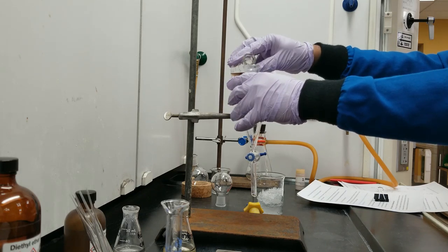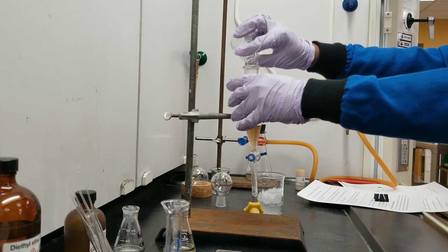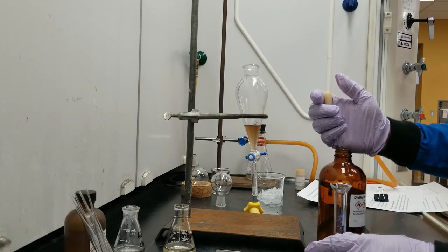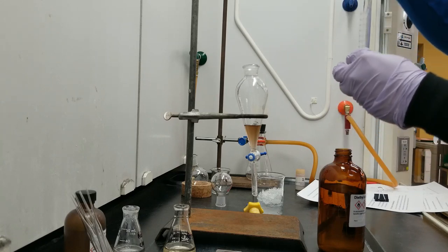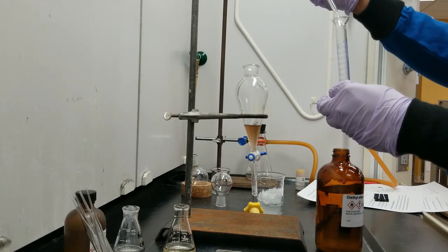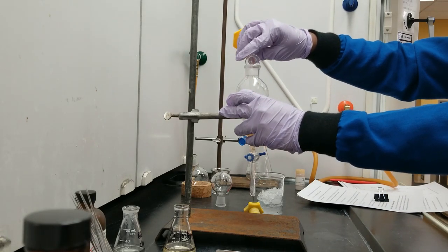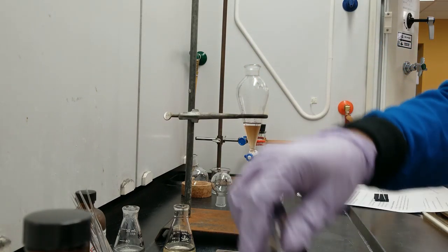Sodium hydroxide extract back into the funnel. And add 3 mils of diethyl ether. Extraction once again to reassure that our sodium hydroxide extract didn't have any acetanilide.